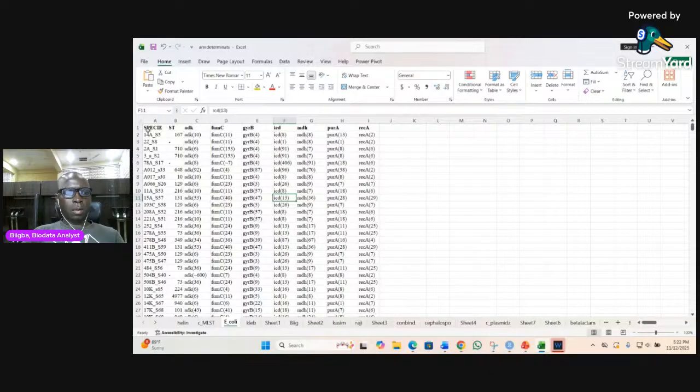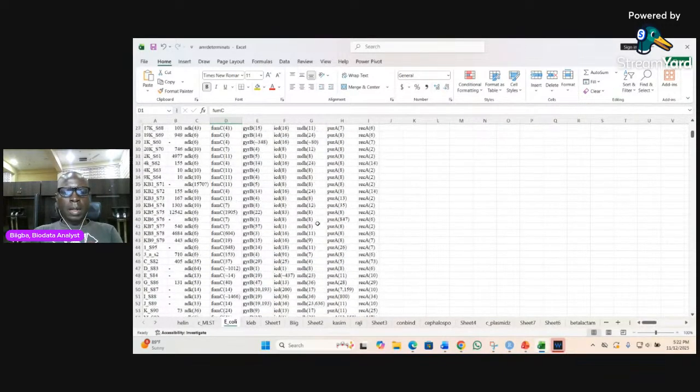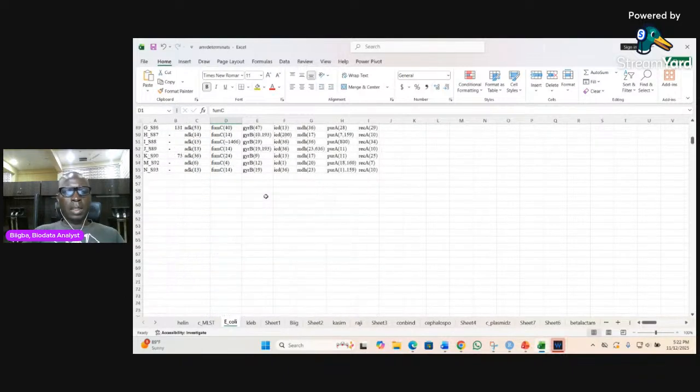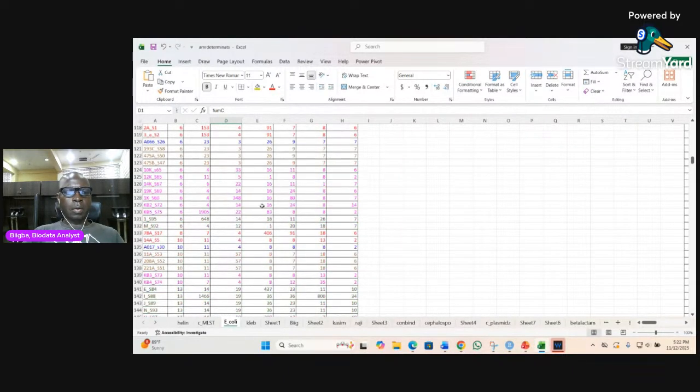First of all, we have it this way. Once we have basic mathematics, when you have a certain character repeating itself, why don't you leave it on top here? So this housekeeping gene is from C. So what we need to do is extract all the housekeeping genes because it's the same thing repeating, and then leave only the allele identification numbers and see what we can do. So I did that already, and that is the result we have here.